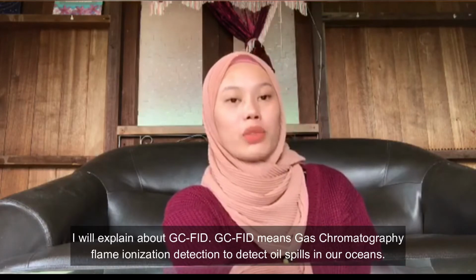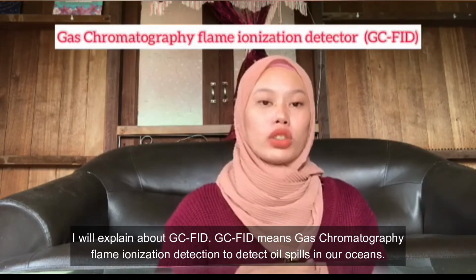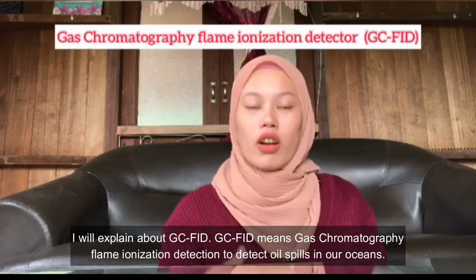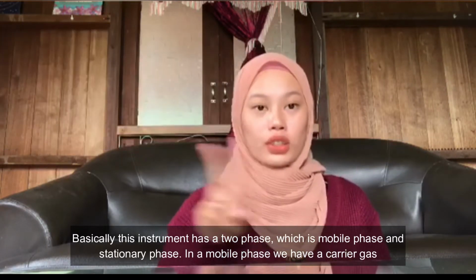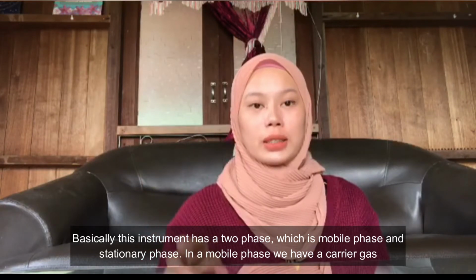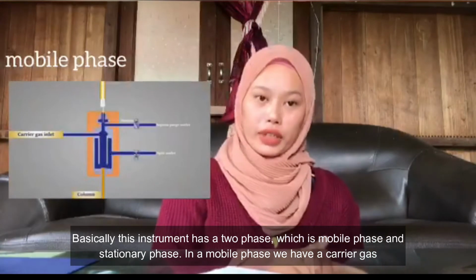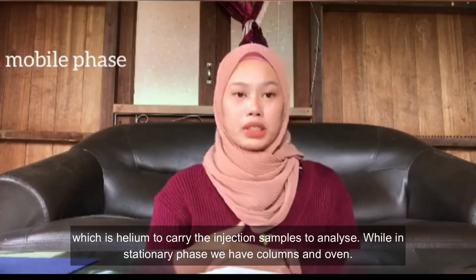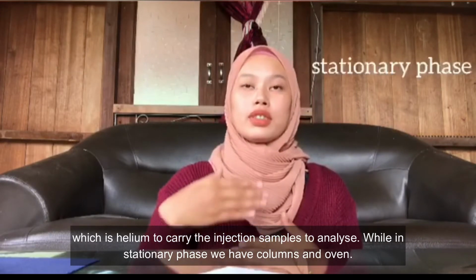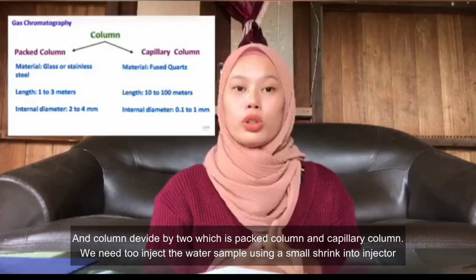I will explain about the GC-FID. GC-FID means gas chromatography flame ionization detection, used to detect oil spills in our ocean. Basically, this instrument has two phases, a mobile phase and a stationary phase. In the mobile phase, we have a carrier gas, which is helium, to carry the injected samples to be analyzed, while in the stationary phase, we have a column and an oven, and the column is divided into two types, a packed column and a capillary column.